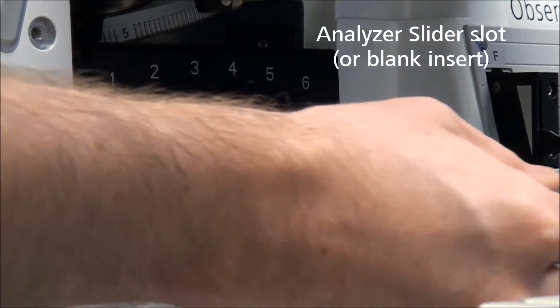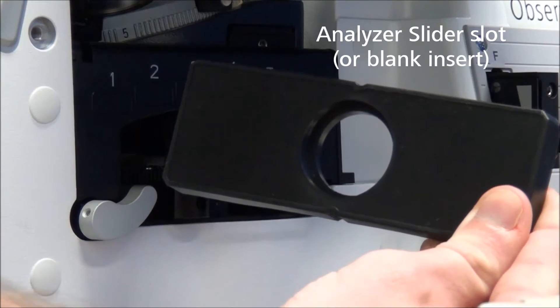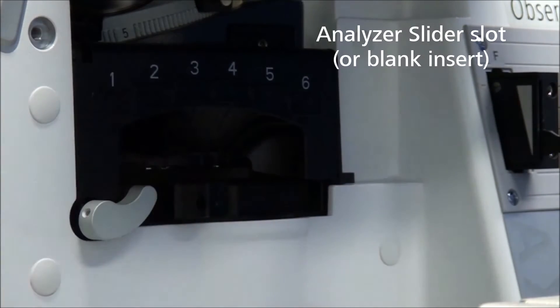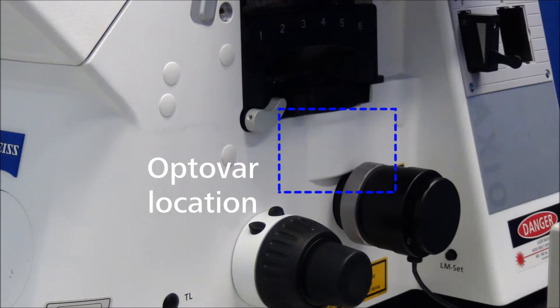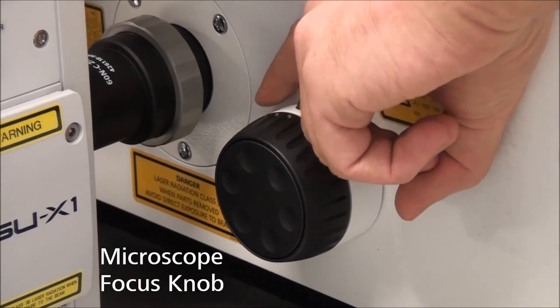If an analyzer slider is installed beneath the reflector turret, slide it to the open position or remove it completely. Set the OPTIVAR to 1x via the roll wheel under the reflector turret or via the touch screen or central button on the focus knob.